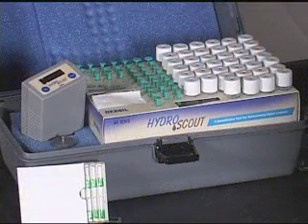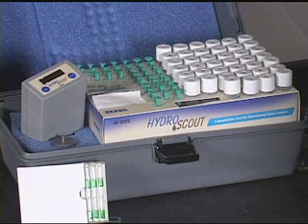HydroScout quantifies the amount of water and oils by measuring the pressure of hydrogen in the reaction tube. Therefore, when assembling the reaction tube, it is important to maintain the calculated volume of the reaction.